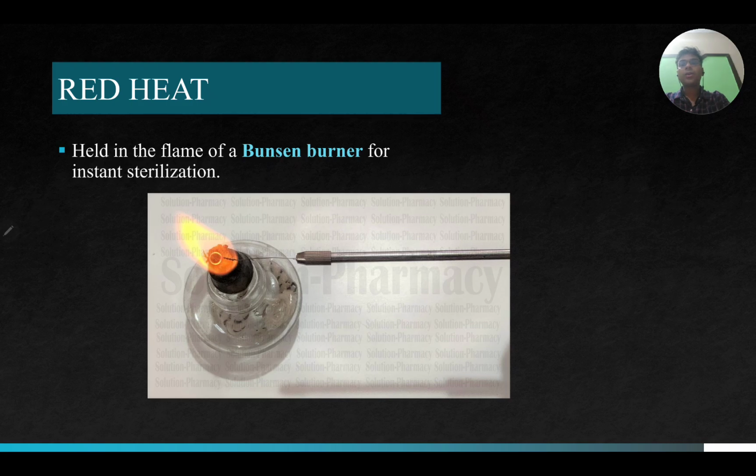Now, red heat, as we have described earlier, is holding the instrument over the flame of a Bunsen burner, for instance, for sterilization.